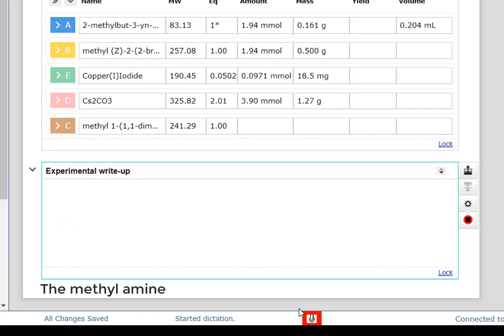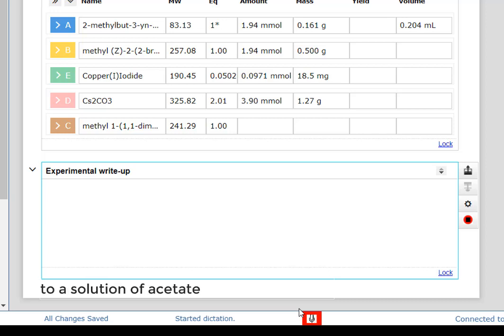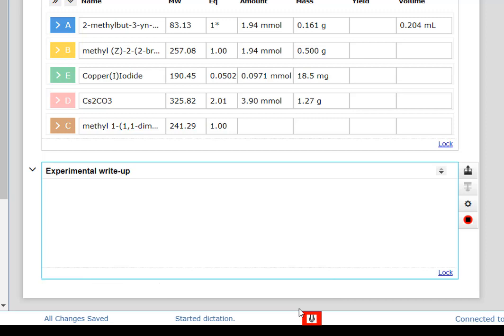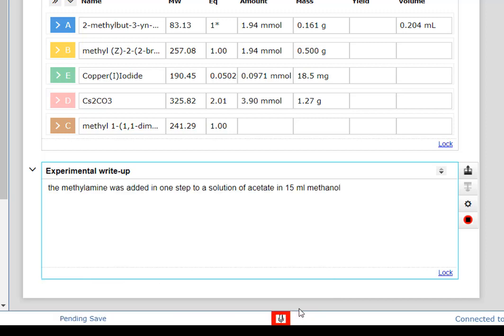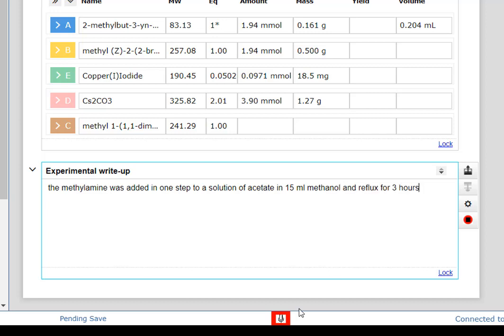The methylamine was added in one step to a solution of acetate in 15 mL methanol and refluxed for three hours.